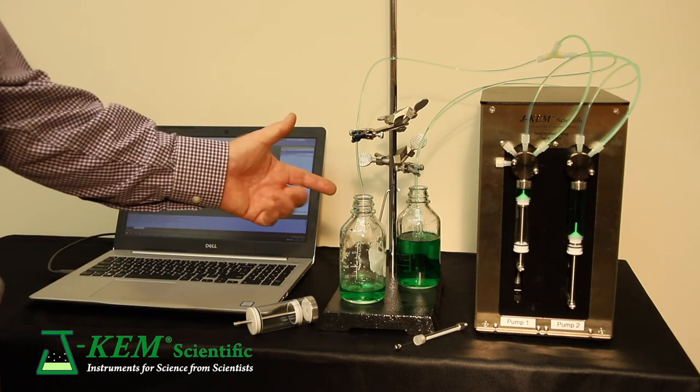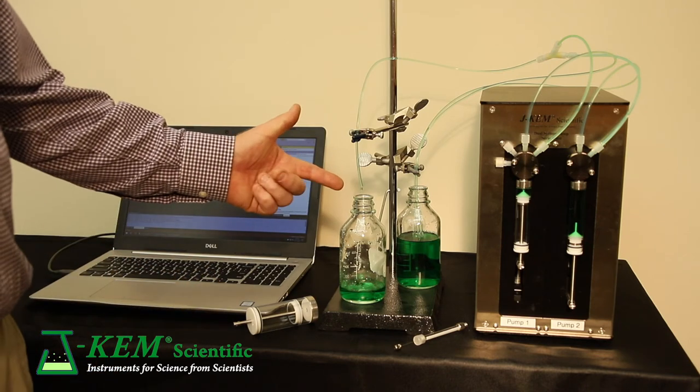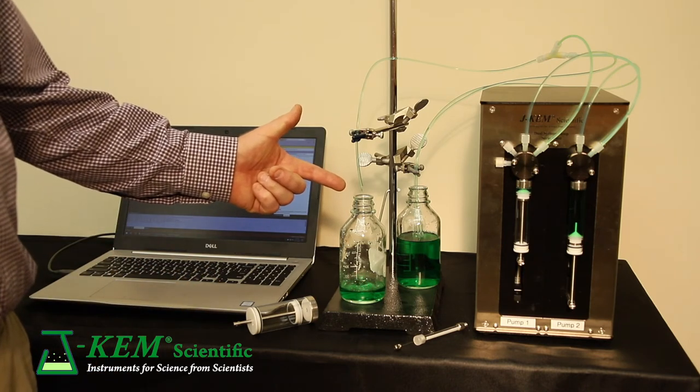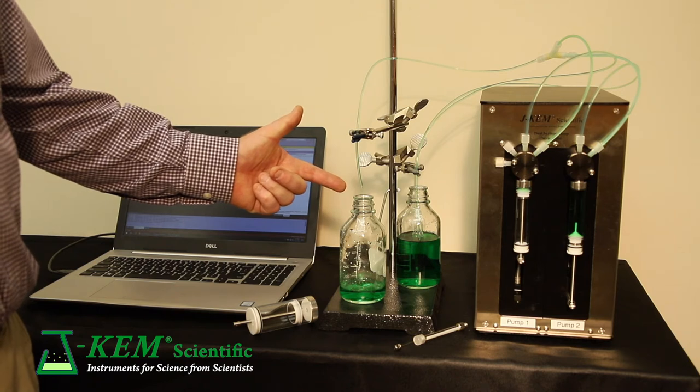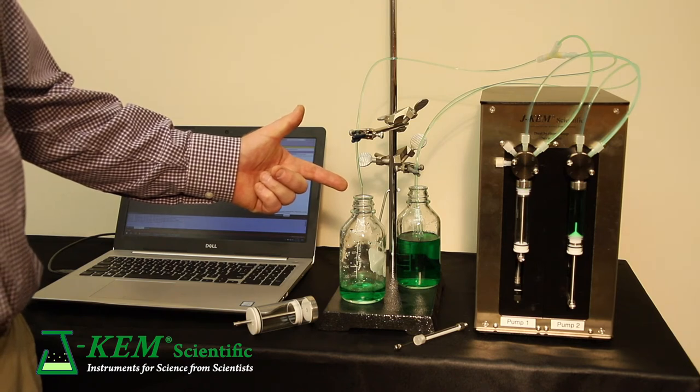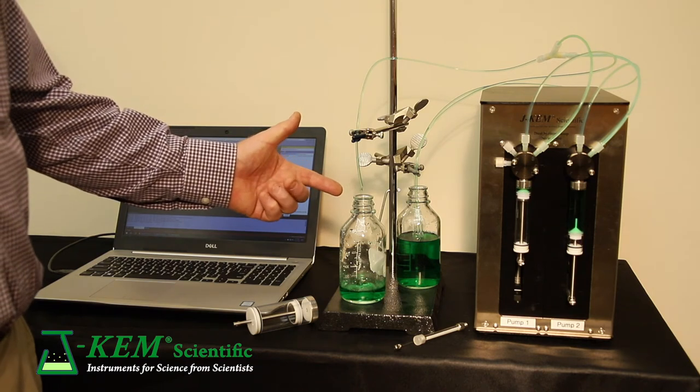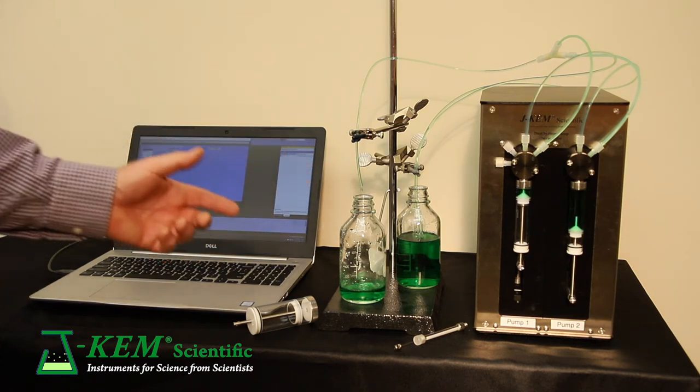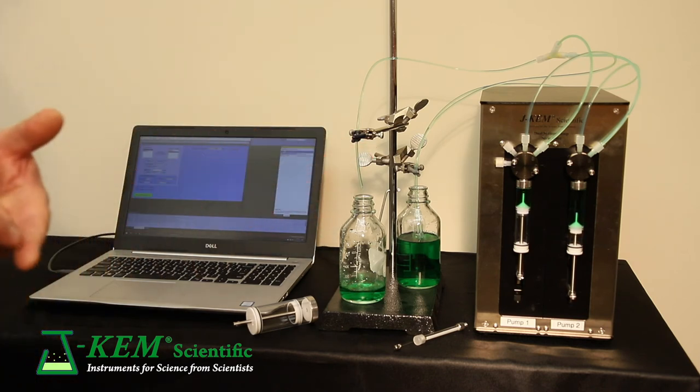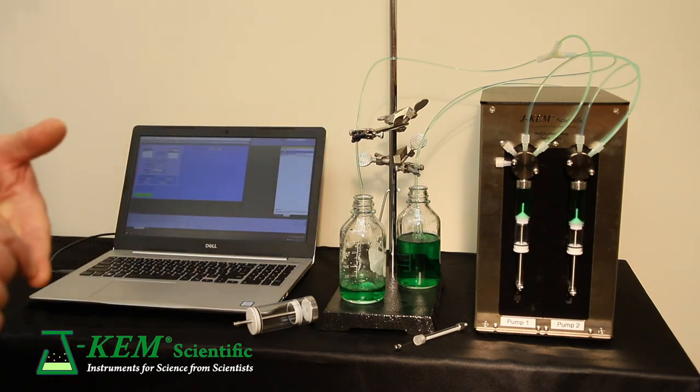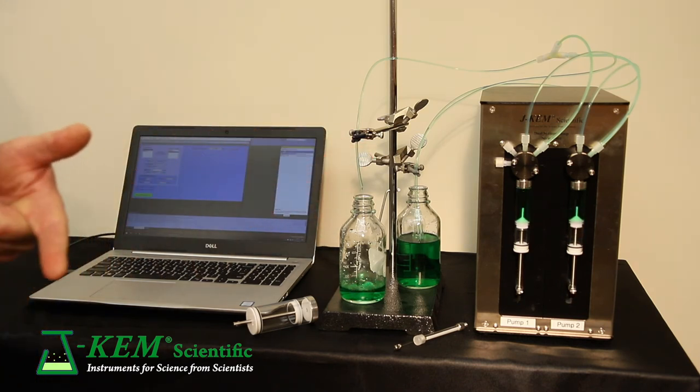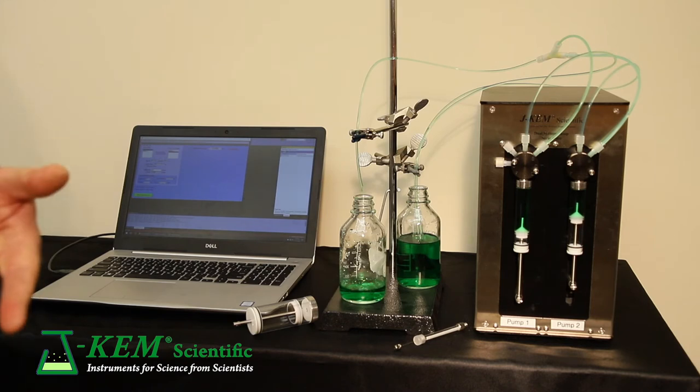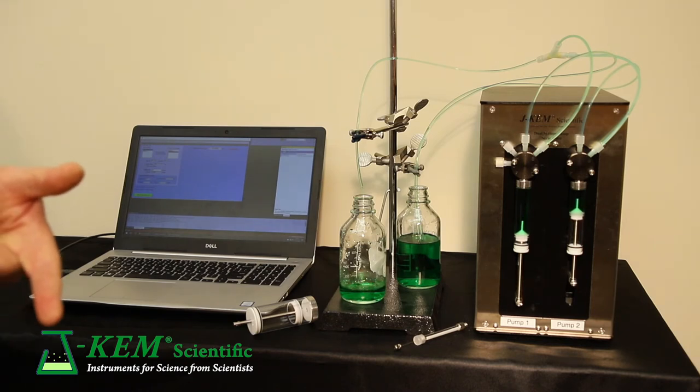So you can see there's consistent flow right now. And what happened was as soon as syringe one was empty, syringe two picked up delivery. So there was never any break in delivery.